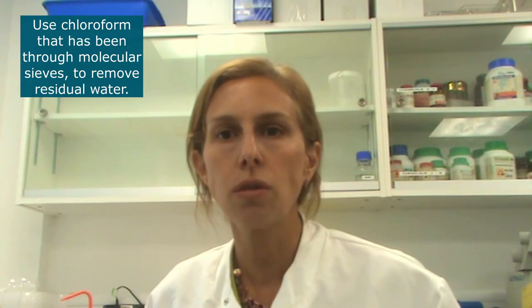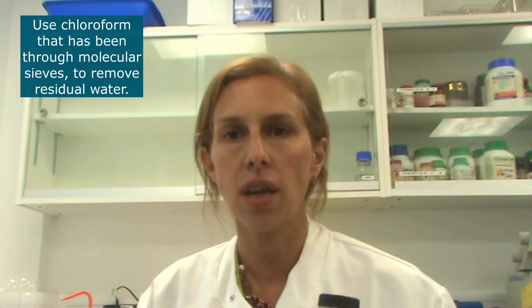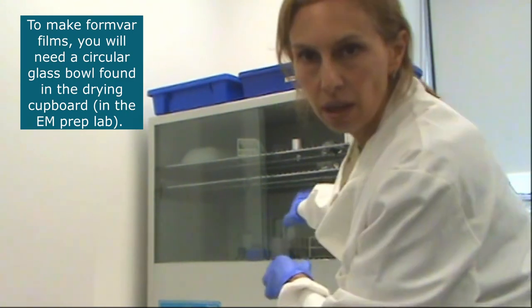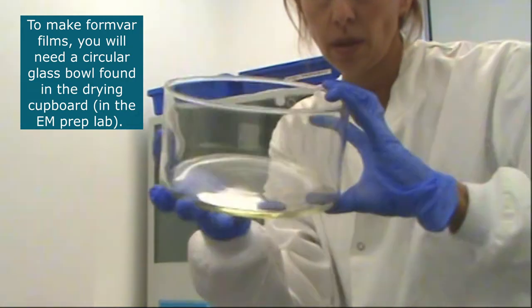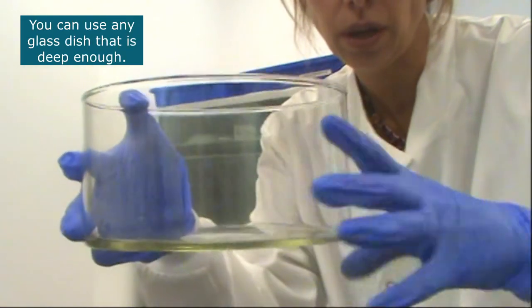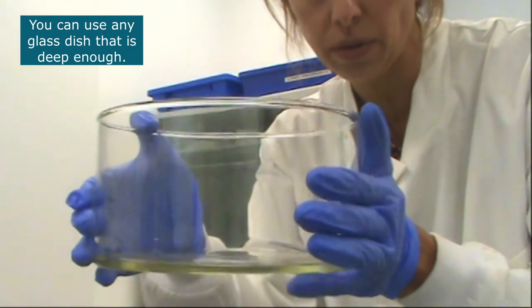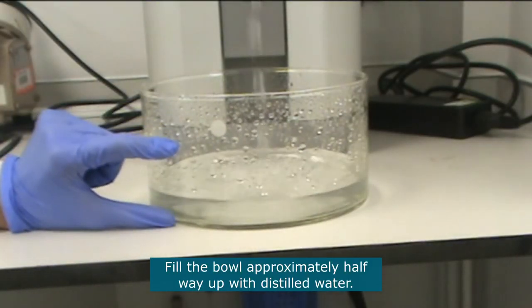Also, make sure that you use chloroform that has been through molecular sieves, so that any residual water has been removed from the chloroform. To make formvar films, you will need this glass bowl that you find here in the drying rack. This bowl here. If you haven't got this bowl, you can use any glass bowl that's quite deep. It needs to be fairly deep for you to be able to make formvar films. Fill the bowl more or less halfway up with distilled water.